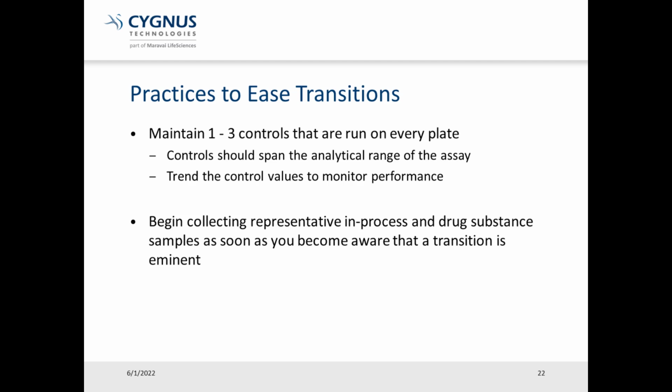If you cannot establish a sample library, then begin collecting representative samples as soon as you become aware that a change is coming. This will allow for timely transition and helps to ensure that you are ready before exhausting the current reagents.